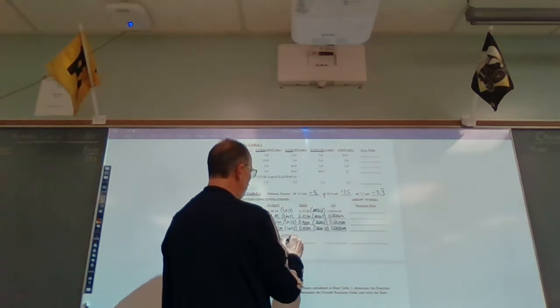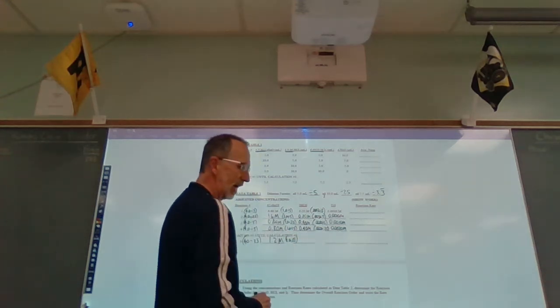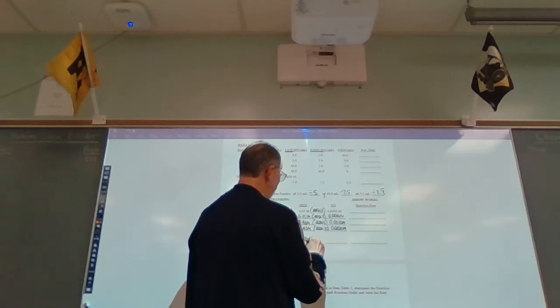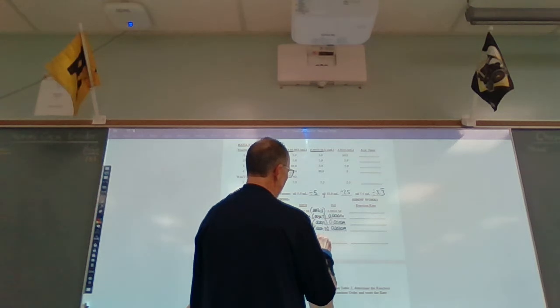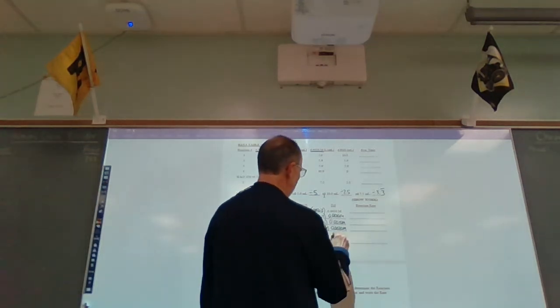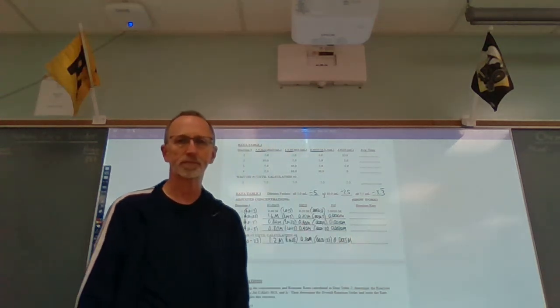We take our 1.0 molar HCl and divide it by 3.3 repeating, the dilution factor. We get 0.30 molar. And then if we take our original concentration of iodine, 0.0050, divide that by 3.3 repeating, gives us an adjusted concentration of 0.0015 molar.